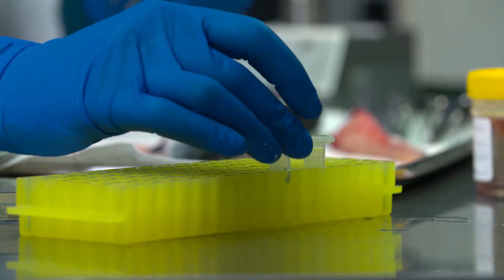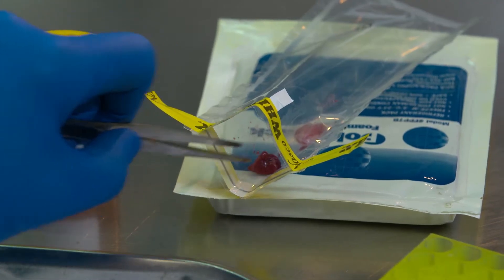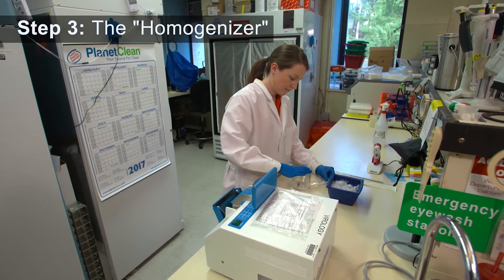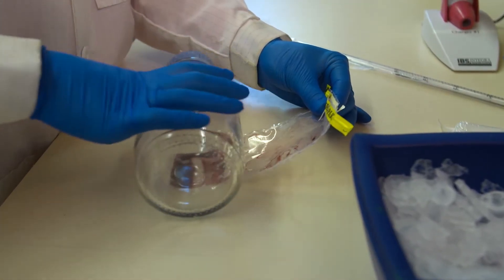The kidney sample is placed in a vial and the other tissues are placed in a sample bag to prepare them for tests to help detect viruses. One method of preparing the samples is to use manual pressure and a bottle to homogenize the tissues.